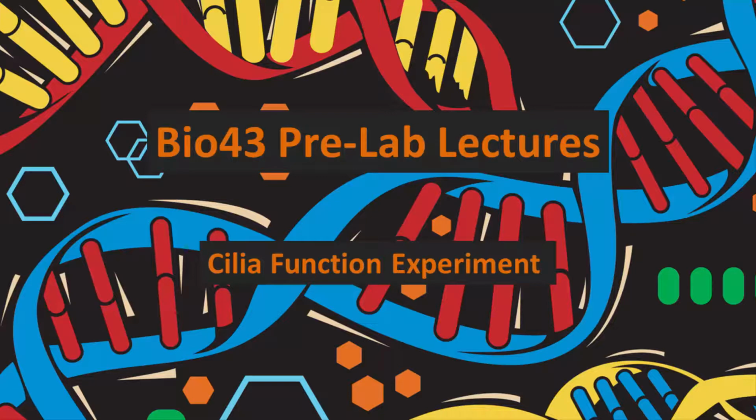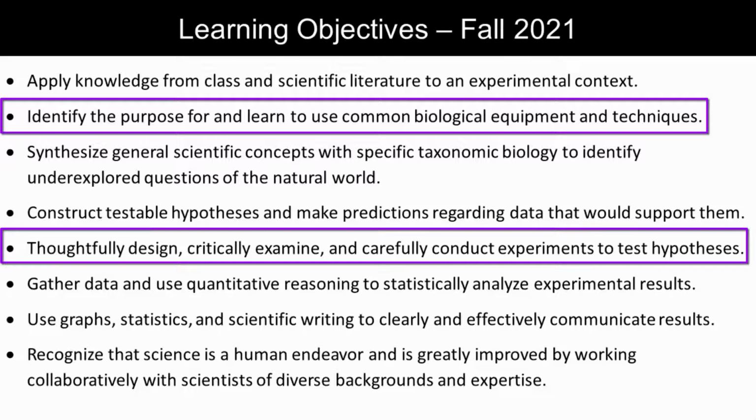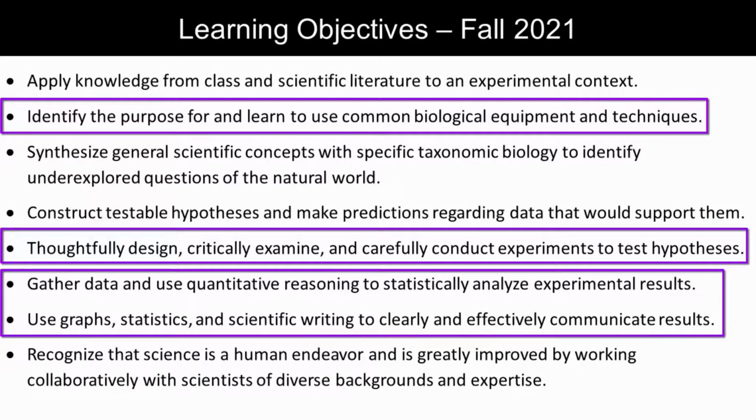This should be the final video you watch for the second week of lab. This video will walk you through an experiment to measure cilia function. You'll see an application for common biological equipment and techniques, learn about a technique you could apply when designing your own experiment, and later use this data to practice graphing and statistical analysis.